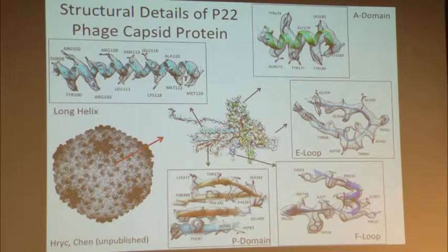And now, after we get that, we raise another question. How do we know this density in the side chains is actually real? Right? So we need to prove that it's not something from the noise. So we did the next experiment to validate that the side chain density is actually real. The way we did it was as follows.